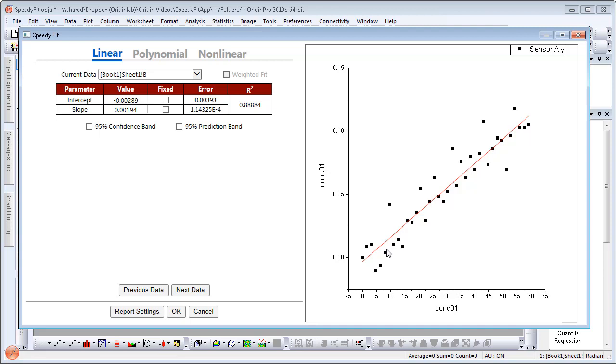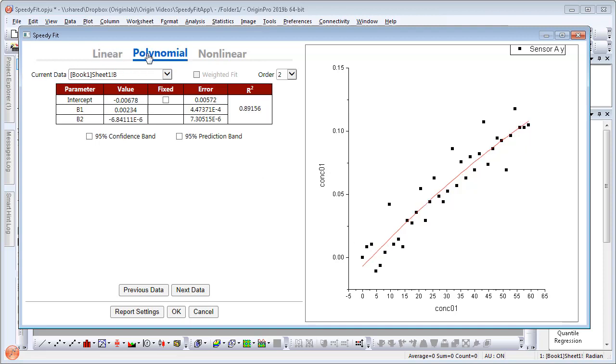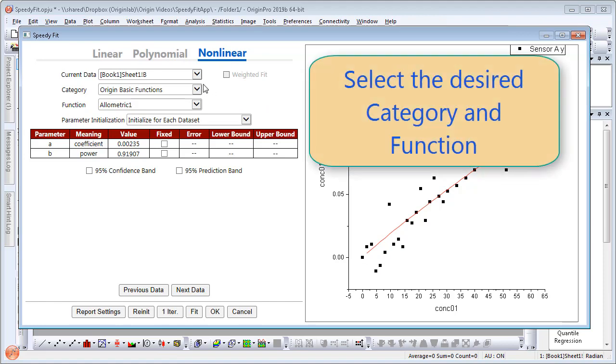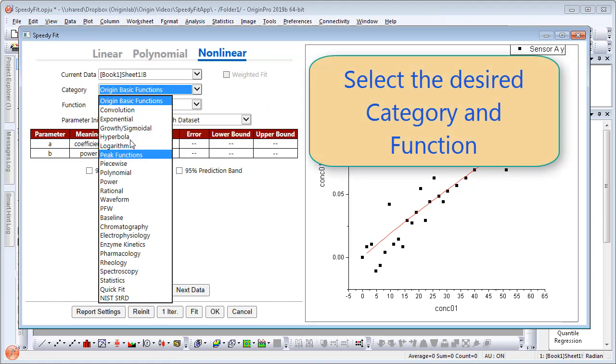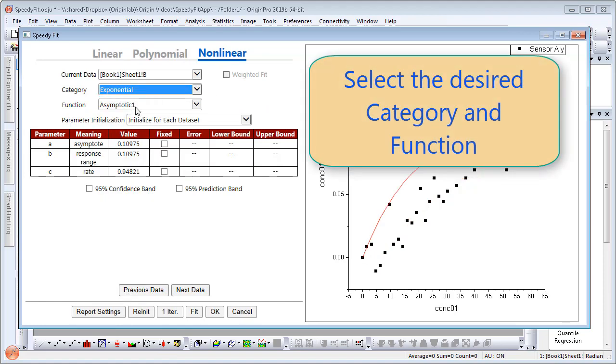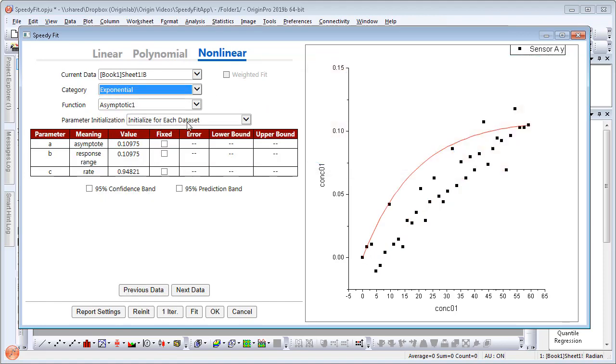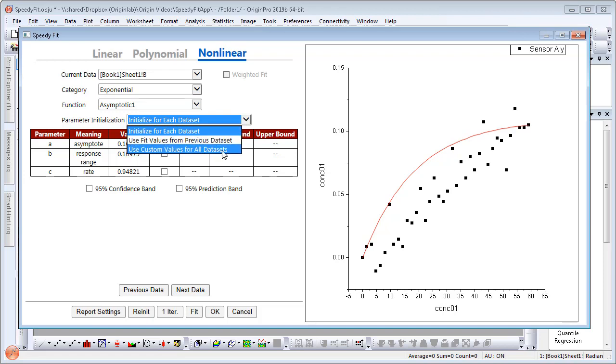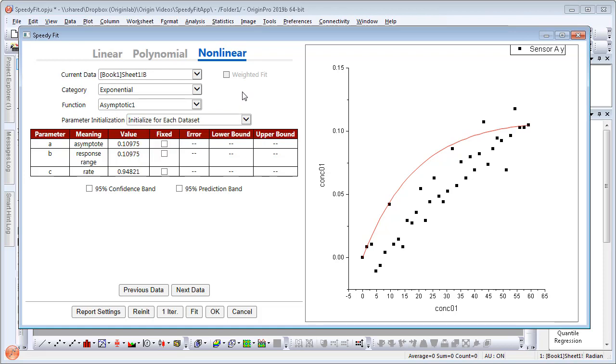You can perform a linear, polynomial, and non-linear fit. There are also options in this app on how to initialize the data. You can initialize for each data set, use fit values from previous data sets, or use custom values for all data sets.